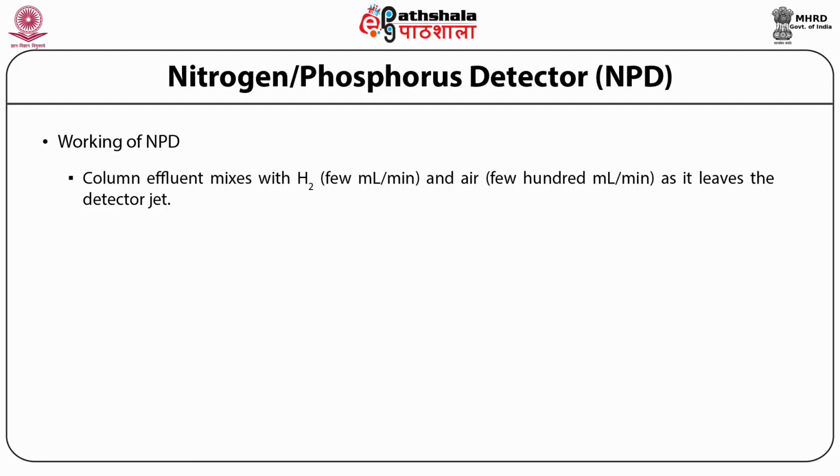It is important to keep the bead cool for maximum sensitivity, especially for nitrogen containing compounds. A flame would overheat the bead, causing similar problems as running the bead with too much current.